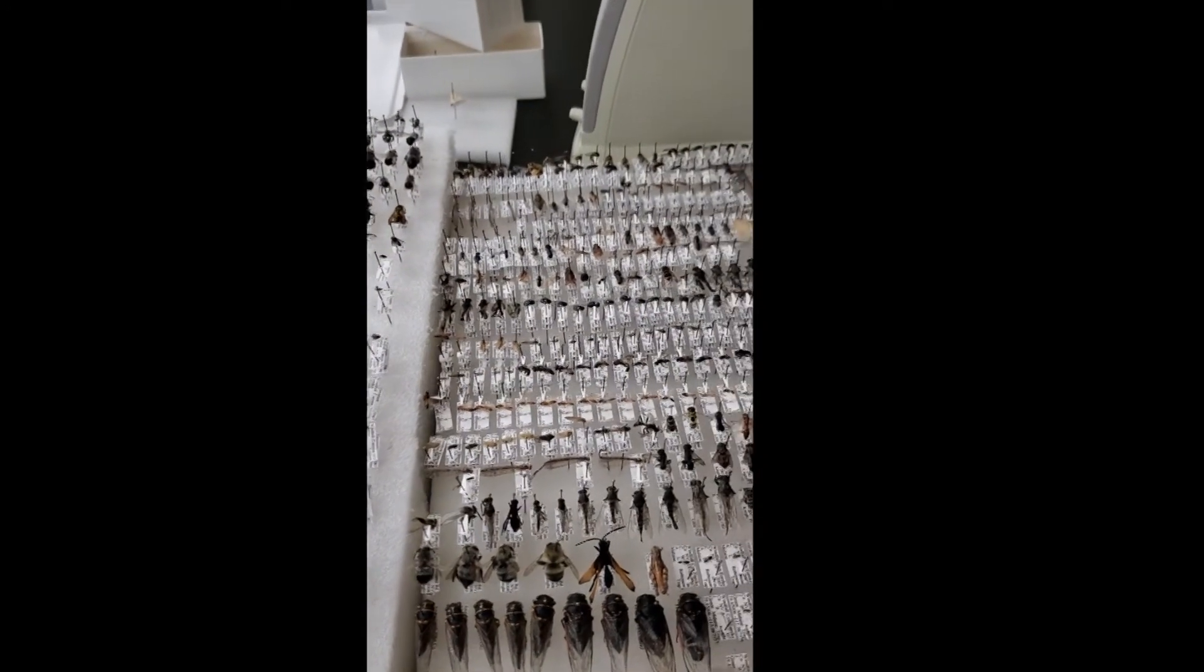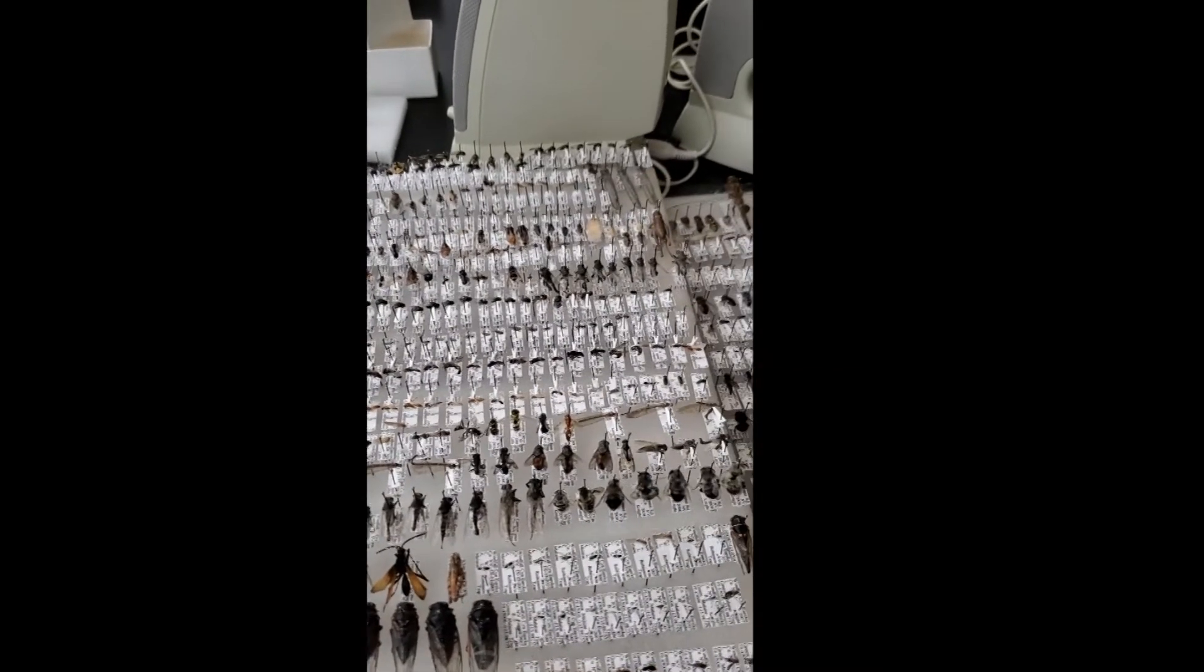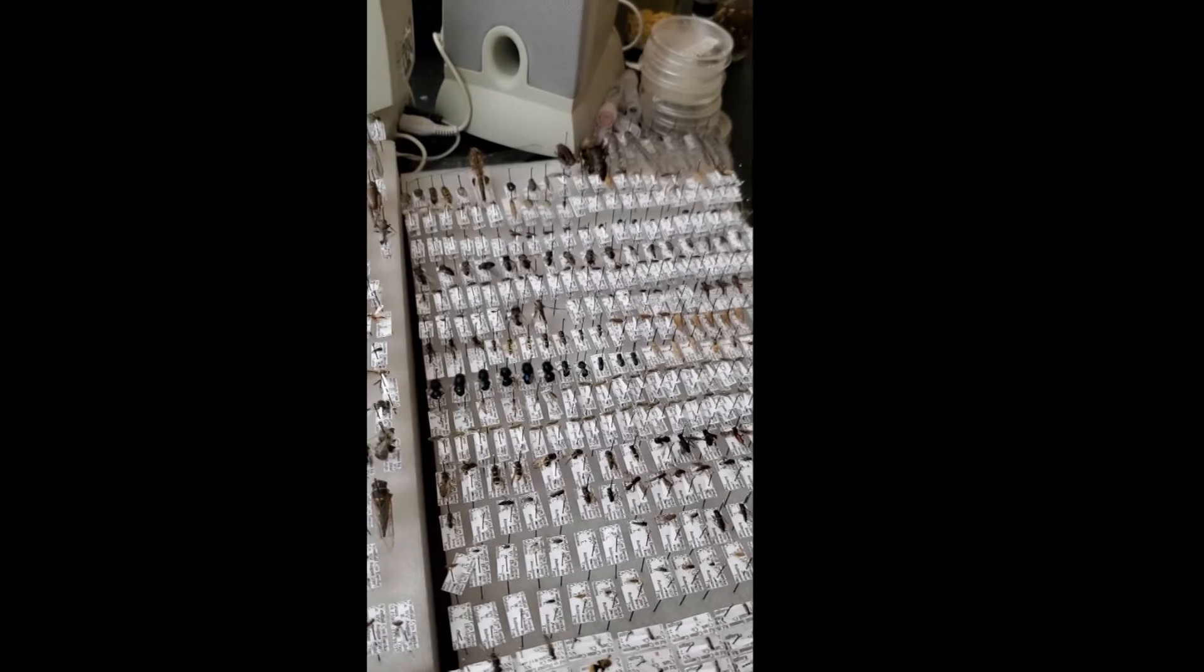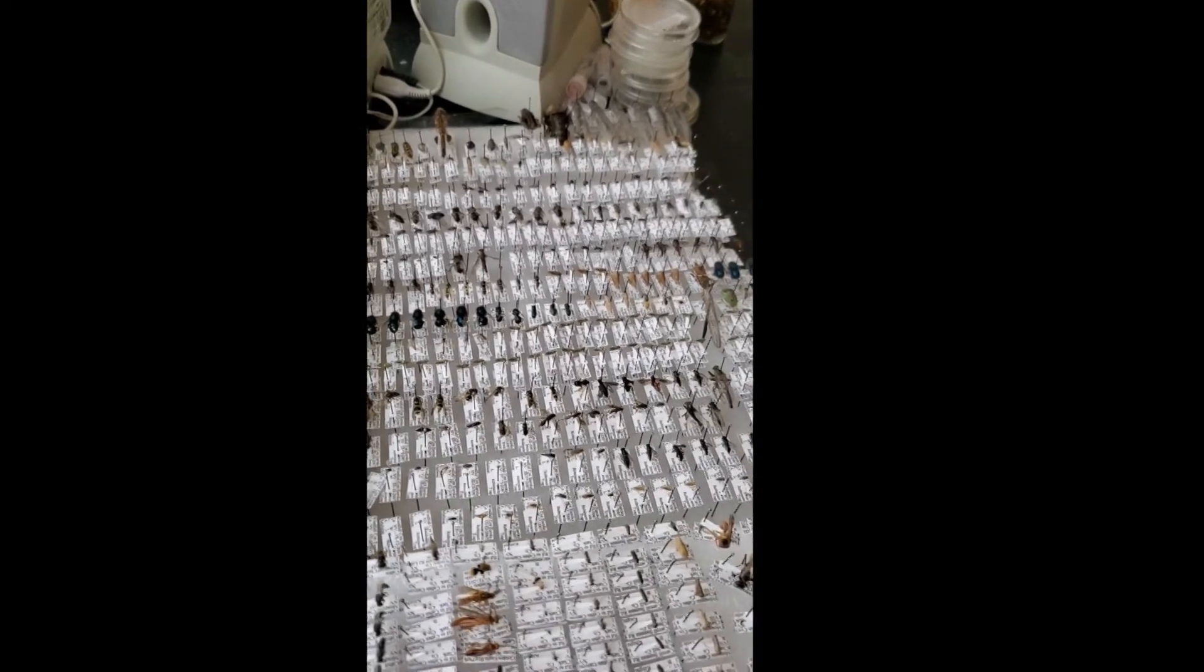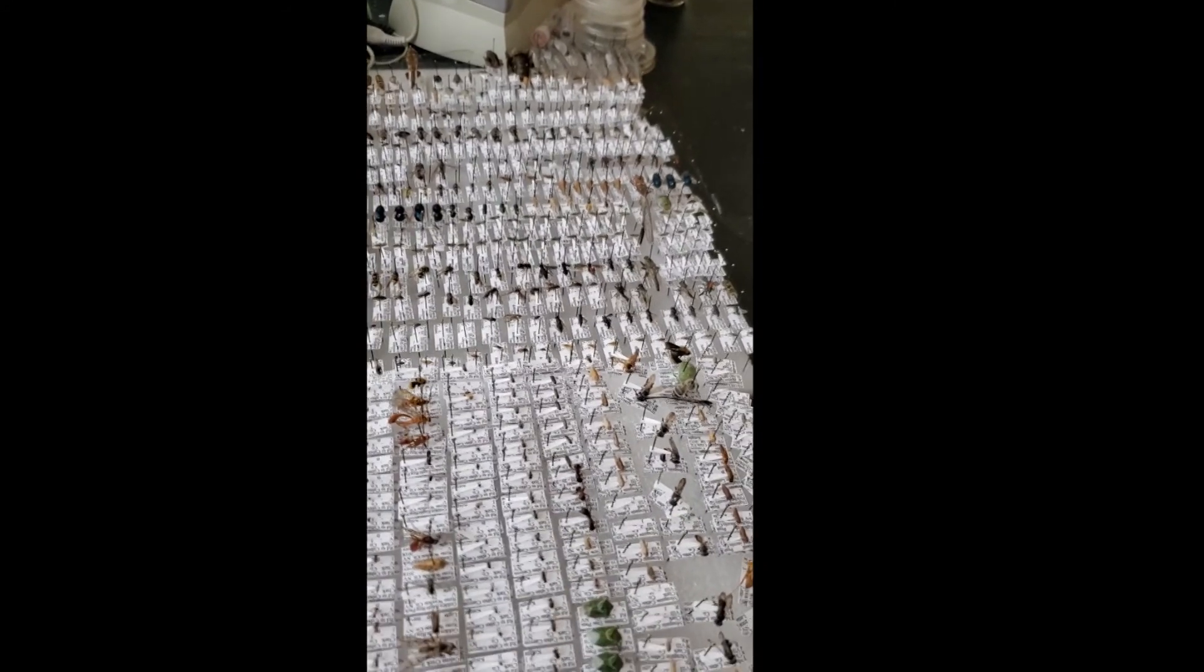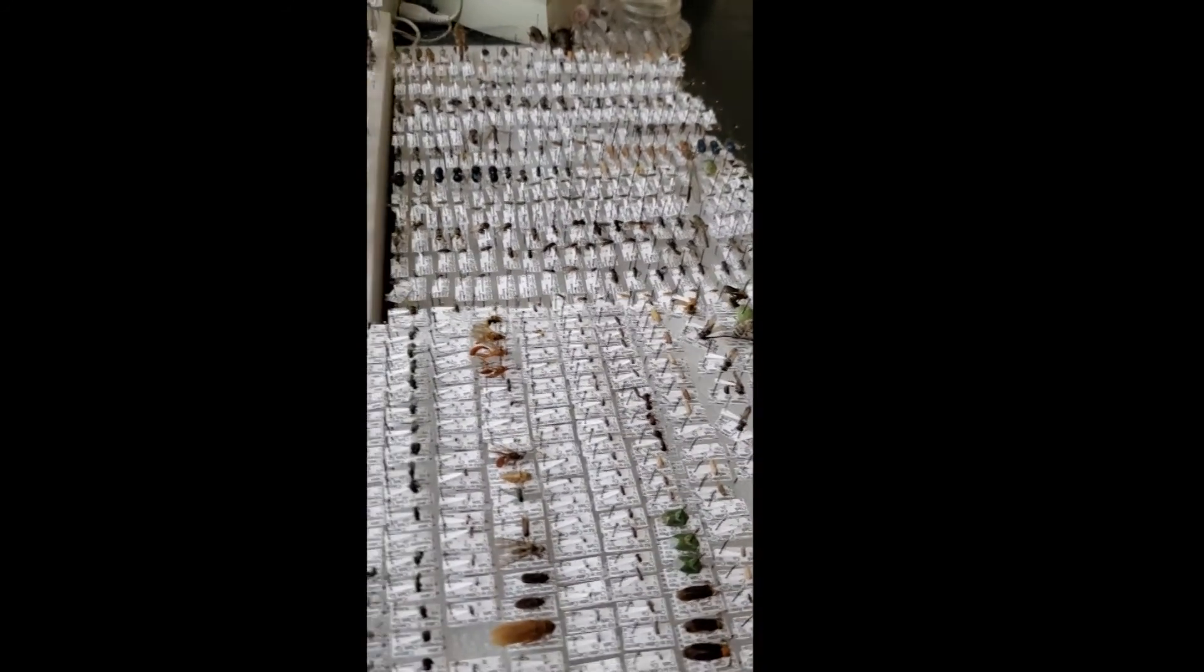Once again, this is something we usually do in the wintertime, the mounting and labeling, when it's our slow period and we're not out running around the state putting traps out or servicing those traps.